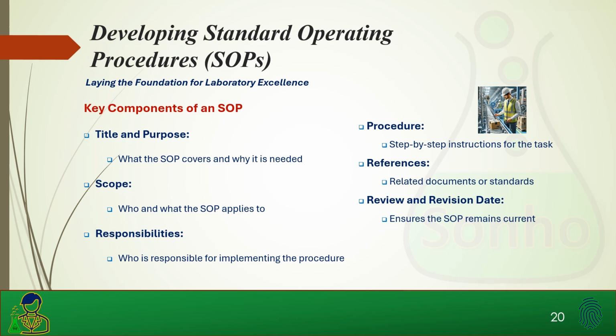As always, it is important to update your SOPs because processes do change. There's nothing wrong with updating an SOP. If your staff identify ways of being more efficient, or if a vendor changes the way they do their processes, the way they sell, they change the lot number, they change what the reagent is called, you need to be updated to what is being currently done in your laboratory, and there's nothing wrong with updating as long as you are recording it.